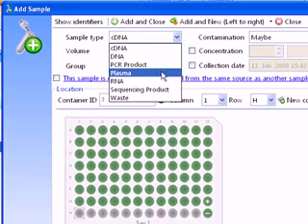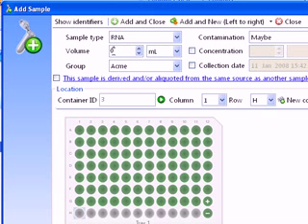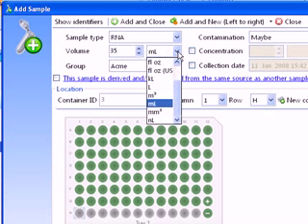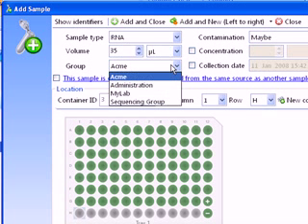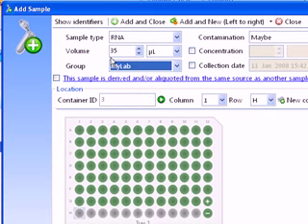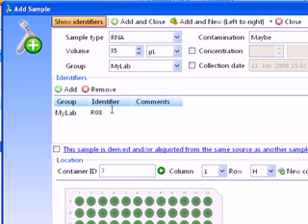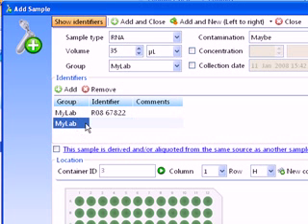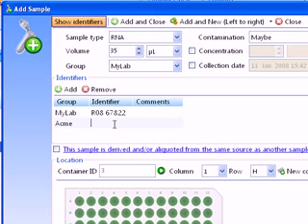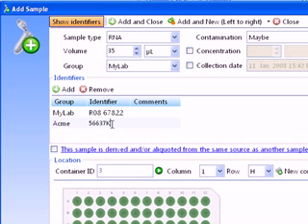Enter the details of the sample. To enter your own identifiers, select the show identifiers button and add them in the list that appears. Note that you can have multiple identifiers for each sample. In this case, we have an identifier assigned from our historical specimen reception system, as well as an identifier assigned by the group that sent us the sample.